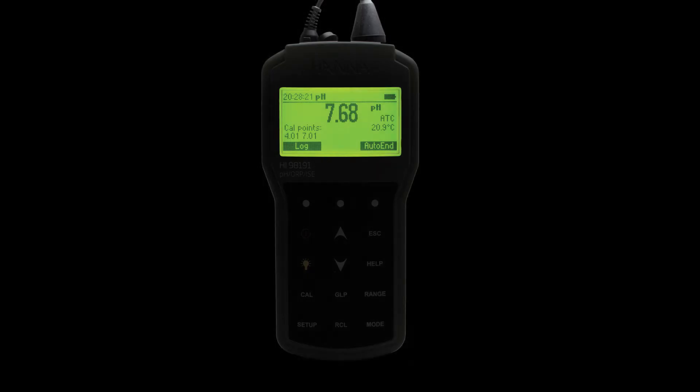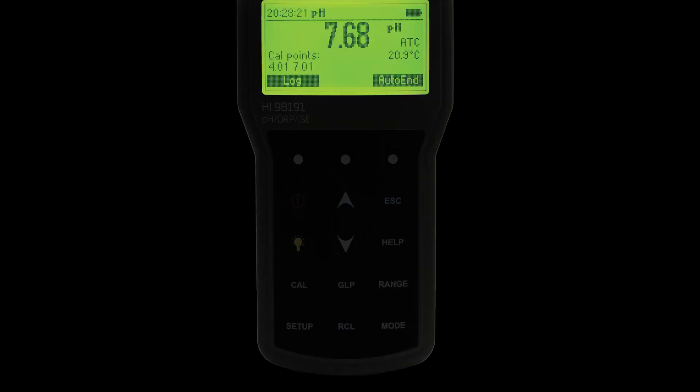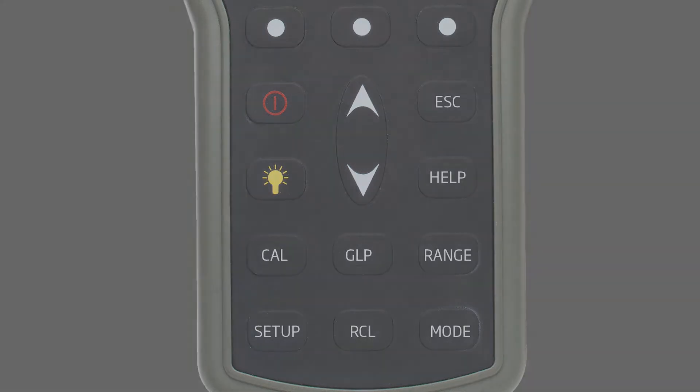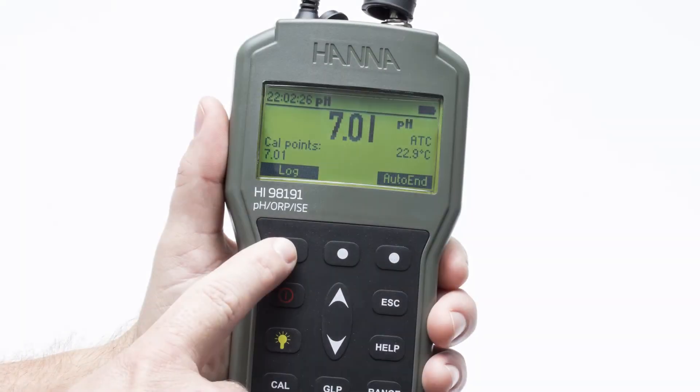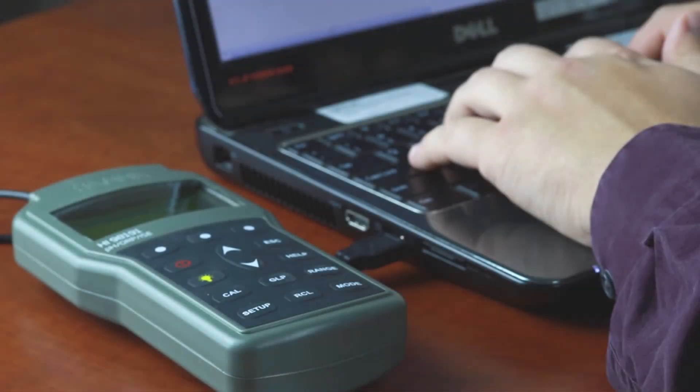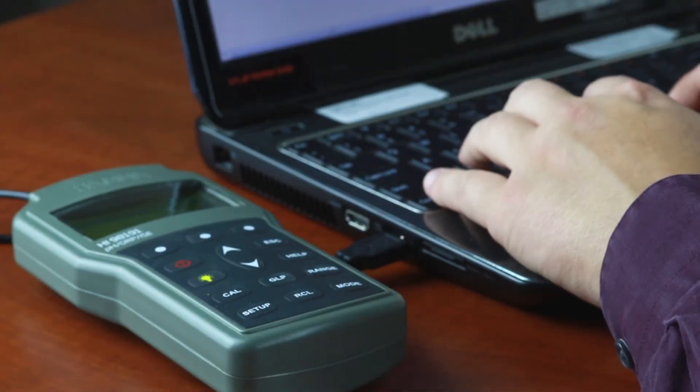The meter features a large backlit graphic display and dedicated keys for calibration, setup, GLP data, and contextual help. Logging data is easy with the simple press of a button. These log measurements can then be transferred to a PC, making record keeping easy.